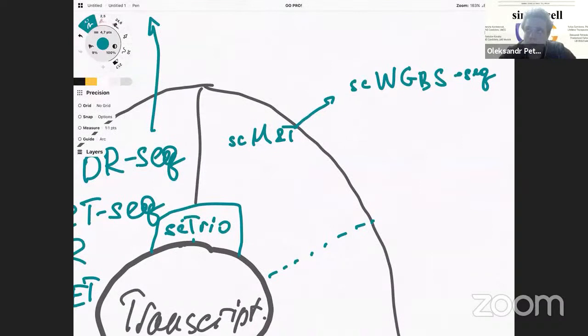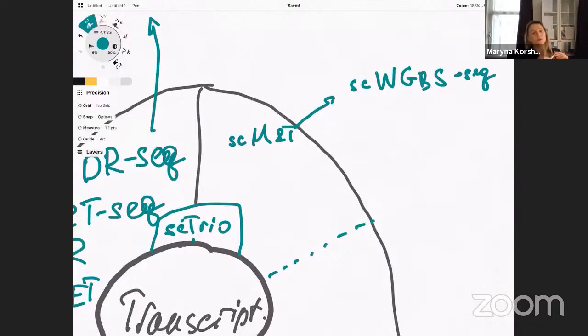What is good and useful in this method is that non-CpG island promoter methylation and transcription are anti-correlated. So that is why you can look into the epigenomic regulation performed by methylation and changes in different transcripts. And that is why you can link this genetic regulatory construct and the output of its activity in your data set.